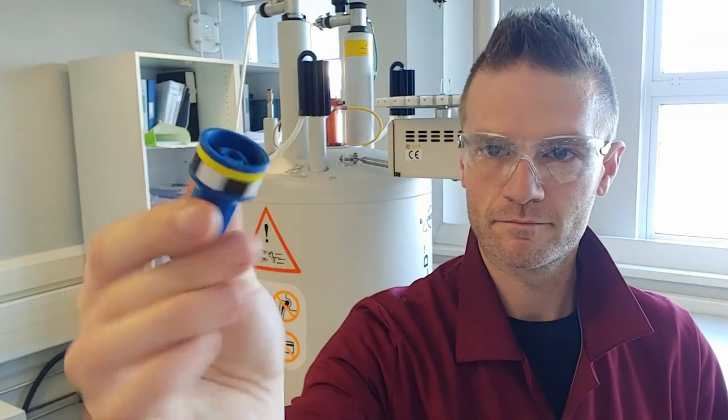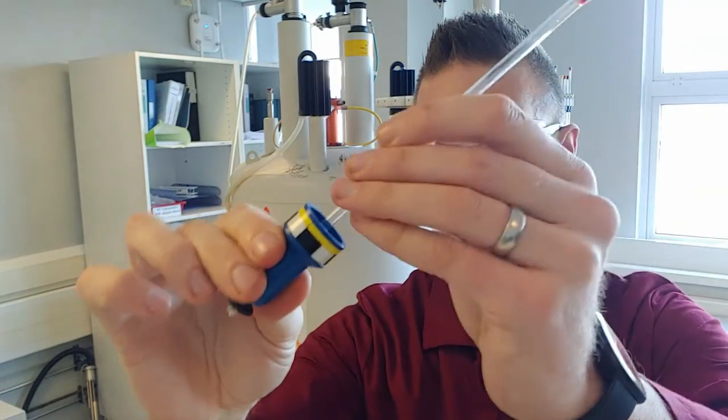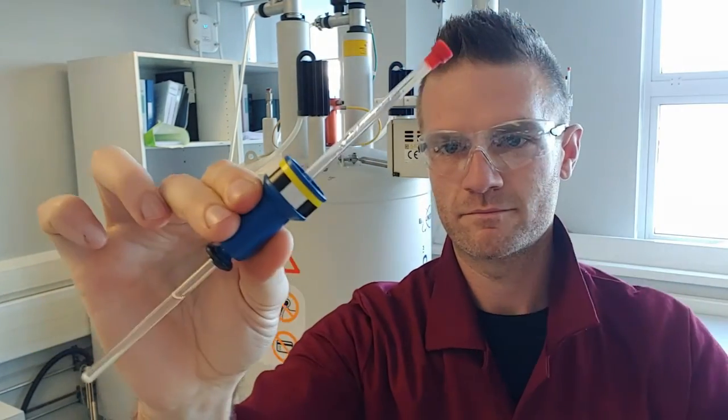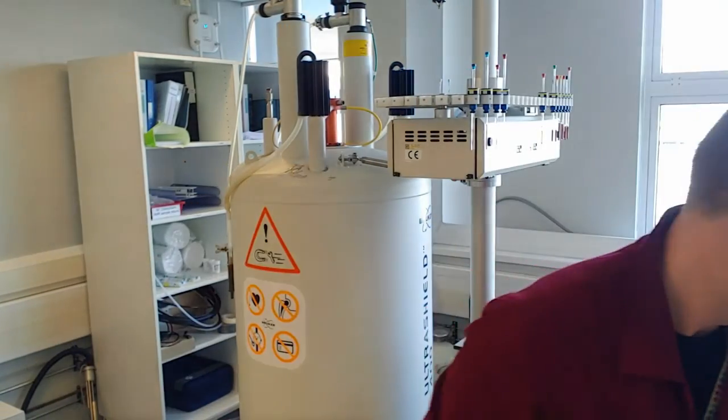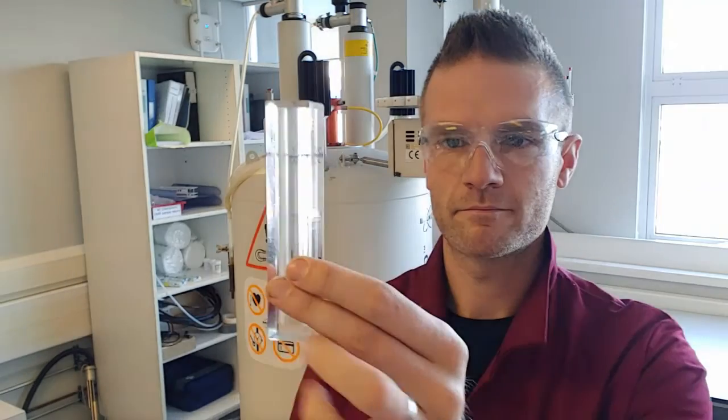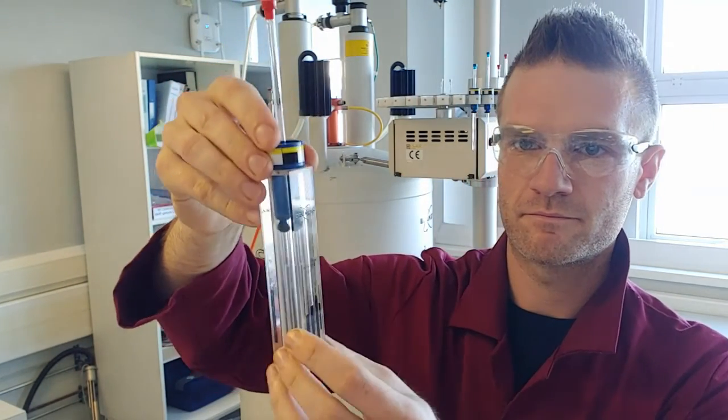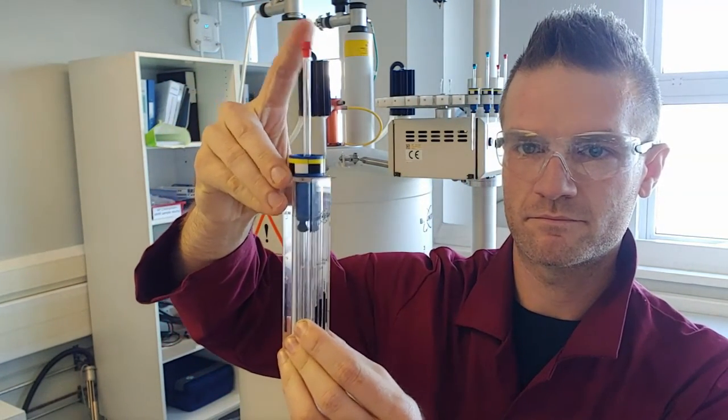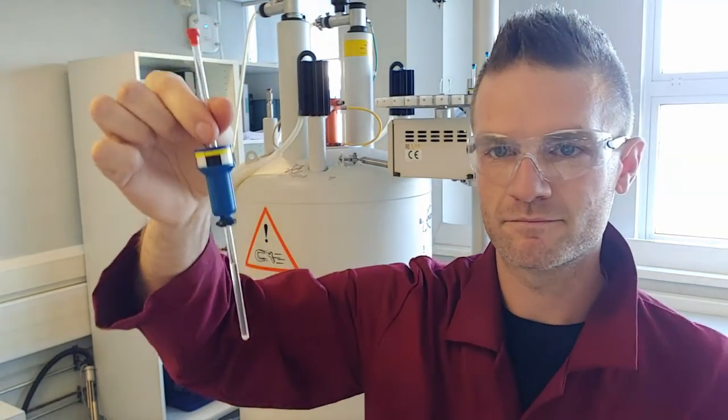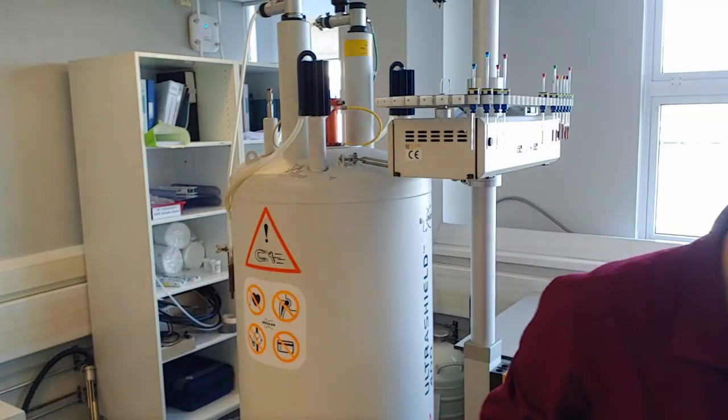So the first thing we need is a spinner so this is basically a sample holder that's going to allow the sample to spin and you place the sample tube into the spinner. You then get a depth gauge and you press the spinner and the sample tube into it to ensure that the sample is at the right height so that it's sitting in the middle of those coils that we saw in the previous diagram.